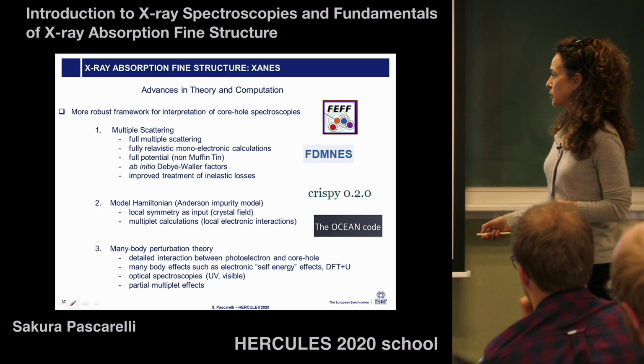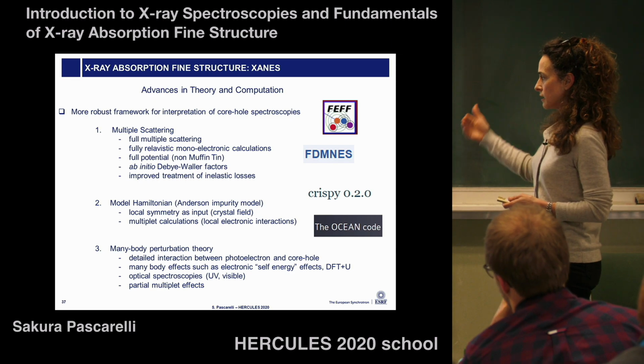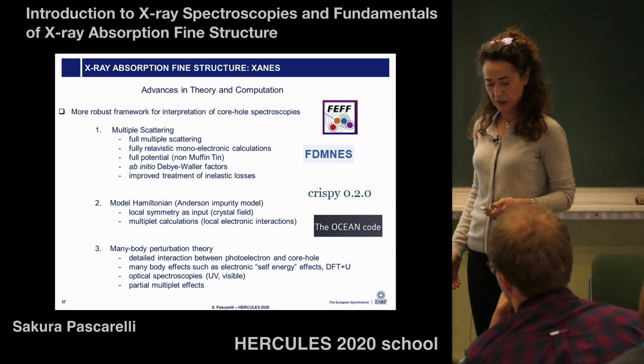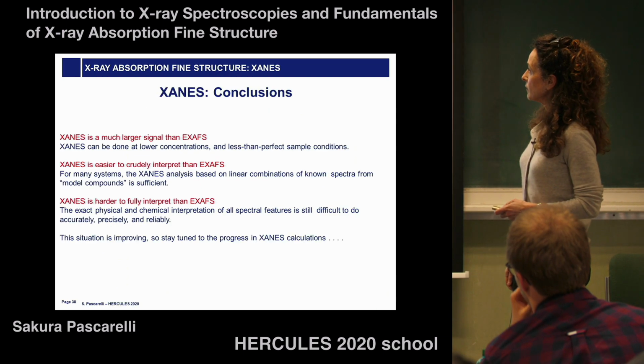But there are also other approaches that are a mixture of both, and so on. I'm just saying that this is a field which is evolving very quickly, with more and more codes, and so it becomes easier to analyze even the XANES.